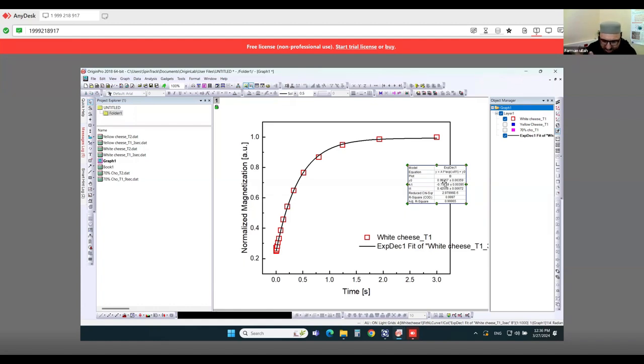And from the fit we can also see whether it is mono or not. If after applying it, it is fitting well to the curve, then we can conclude this. Let me check the second function.